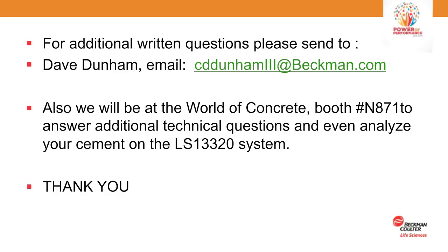Well, I'm sorry. I see some more questions coming in, and since we have some more time, let's go through them. So another person asked, how does the auto rinse work? The auto rinse is computer controlled. The module has a top level optical level sensor. So we drain and fill the module three times, or this is actually selectable by the operator.